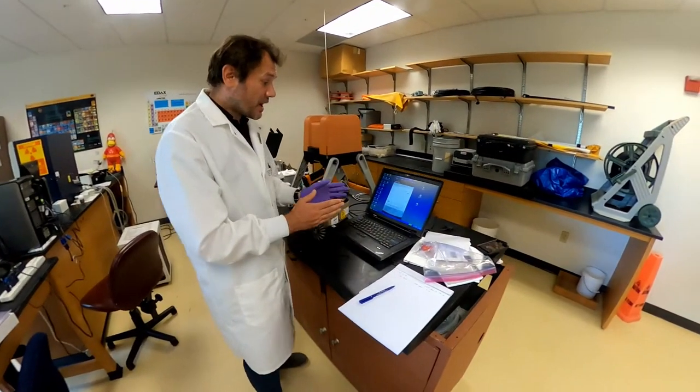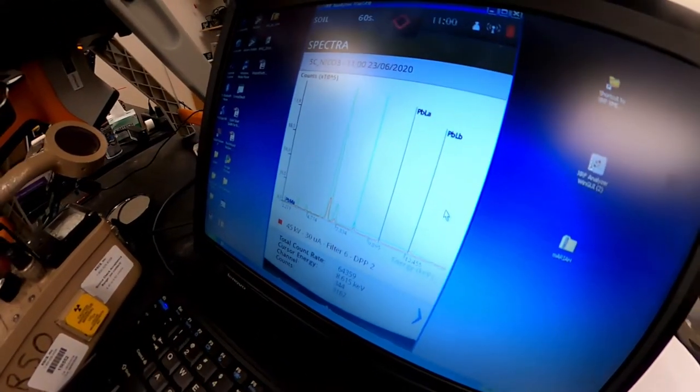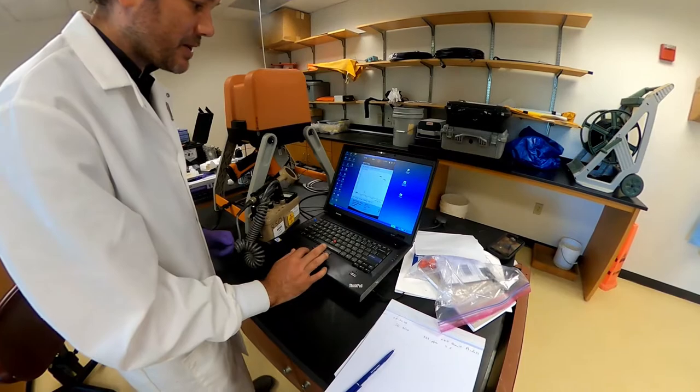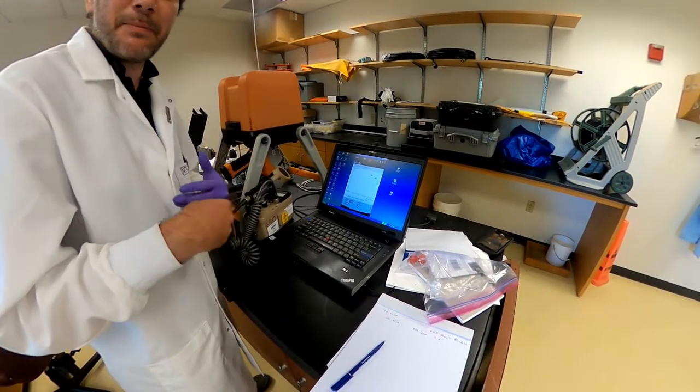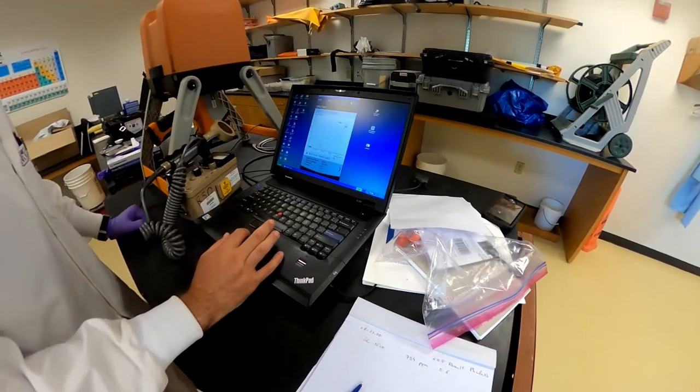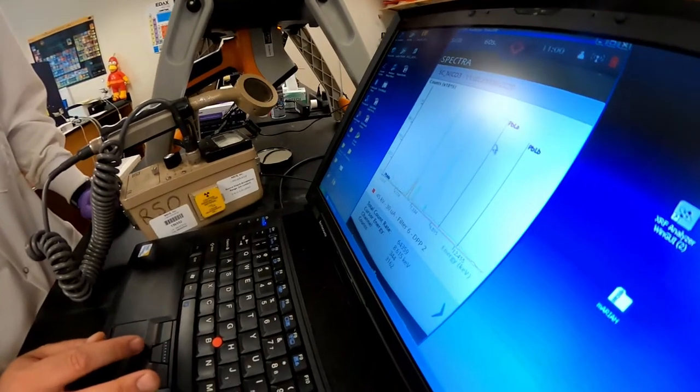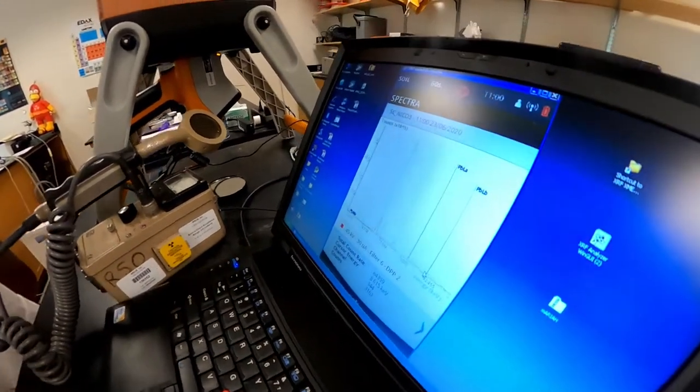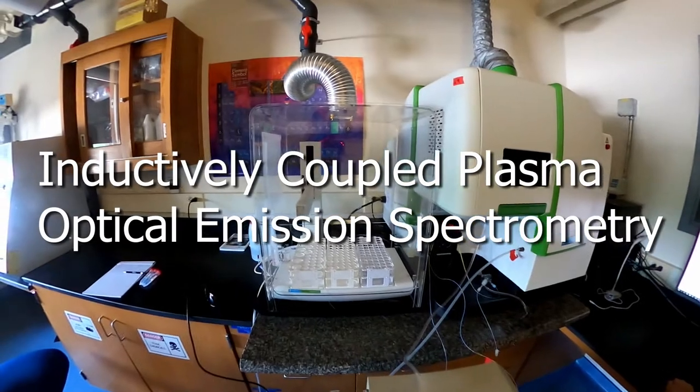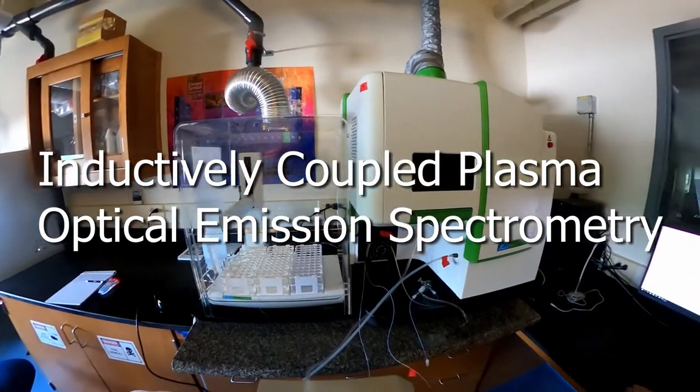So, this is the spectra that is generated during the analysis. And so, the numbers we get are actually used, determined using a calibration. And that's basically the amount of energy that is coming out to the detector. And here, a specific energy. And that's this energy that is emitted when the electrons are coming down one or two orbitals after excitation. And here, we see some bumps. All right, bumps that correspond to lead, lead alpha and lead beta emissions. That means that the third shell electrons have been going down to the second shell electron.